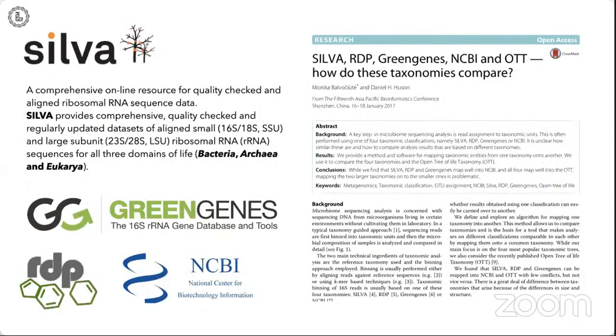So once this quantification is performed, as I mentioned, they are identified to be part of these specific ranks using special taxonomic information for domains of bacteria, archaea, eukarya, etc. Right? It is primarily based on the phylogenies of the subunits of rRNA, and thank you, Ramkumar, and yeah, subunits of the 16S or 18S rRNA and their relationship to the taxonomic ranks that we already discussed.